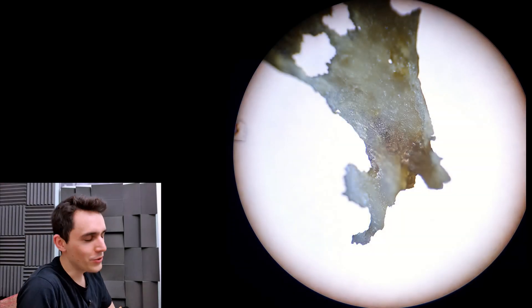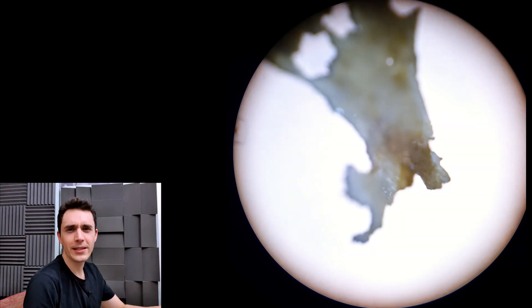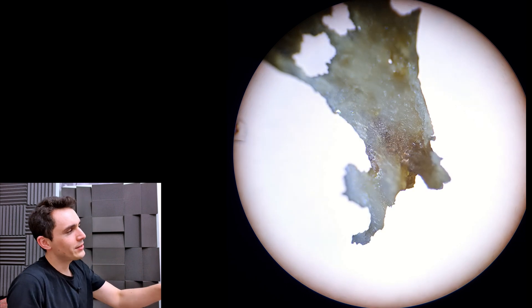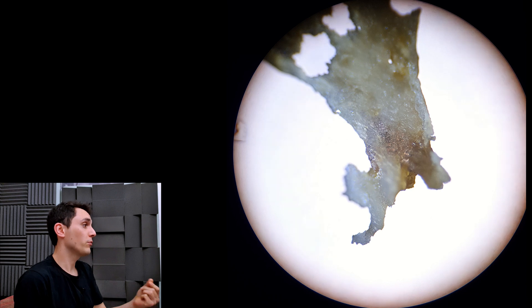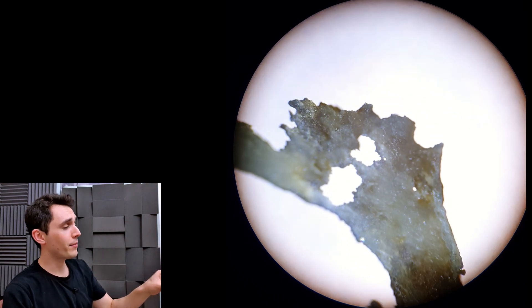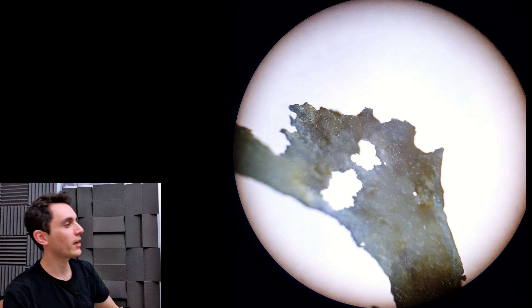Hey everyone, welcome back to part two of this very interesting case. This is the little piece of bone — the little piece of dead mastoid bone or bony sequestrum — underneath the compound microscope at times 40 magnification.